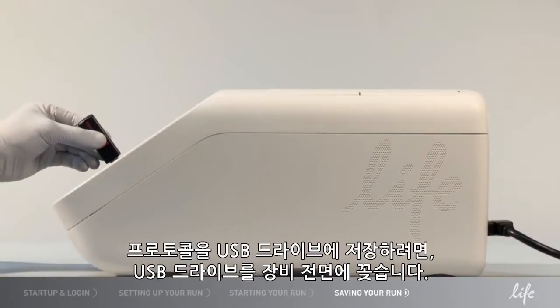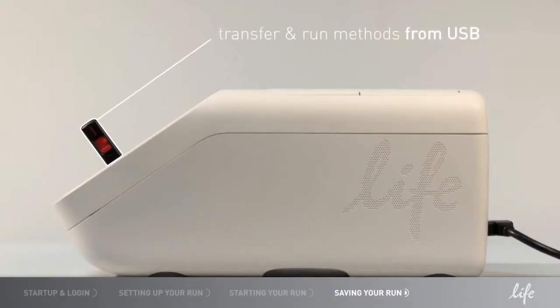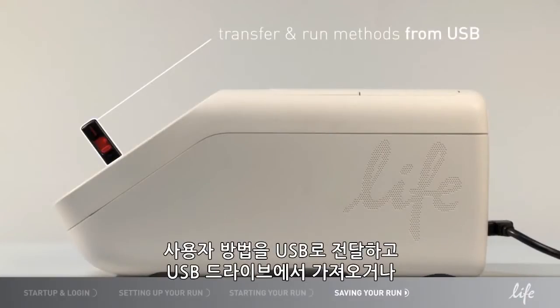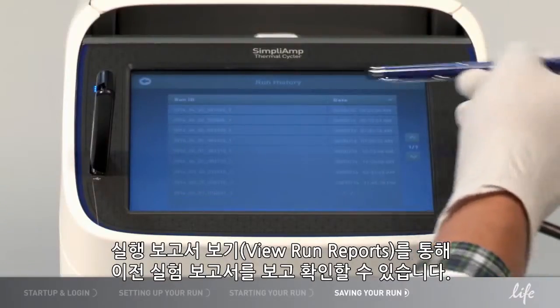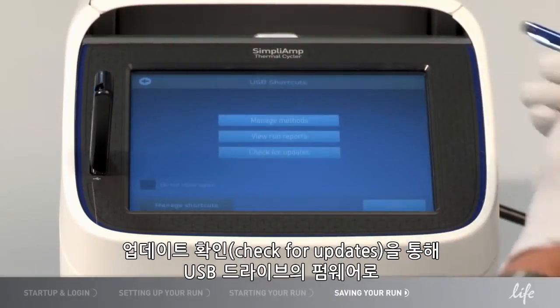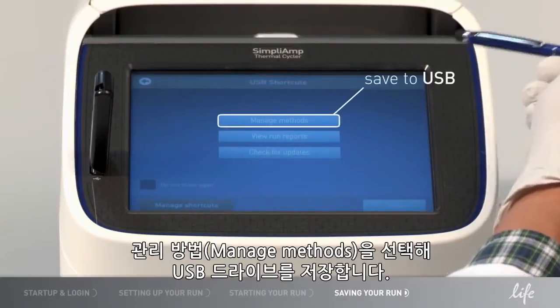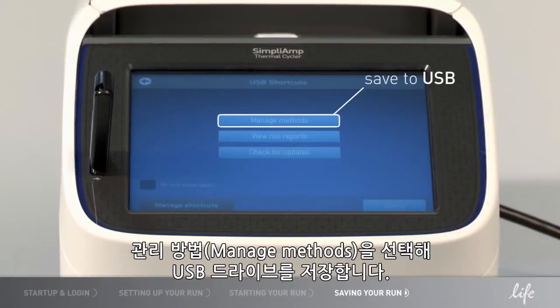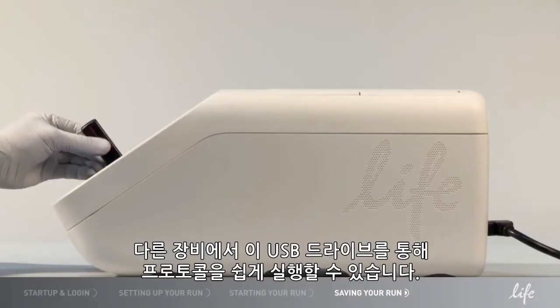If you would like to save the protocol to a USB drive, plug in the USB drive at the front of the instrument. You can transfer your methods to and from the USB drive, or run a method from the drive with Manage Methods. You can view and verify your previous experiment reports with View Run Reports. You can update instrument firmware with Check for Updates. Select Manage Method to save to the USB drive. It is easy to run the protocol with the USB drive on another instrument.